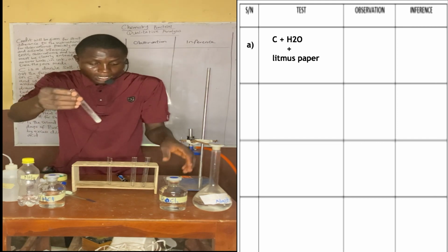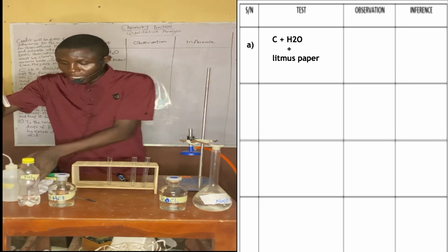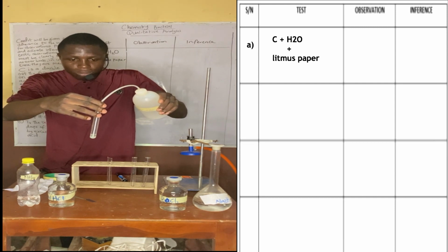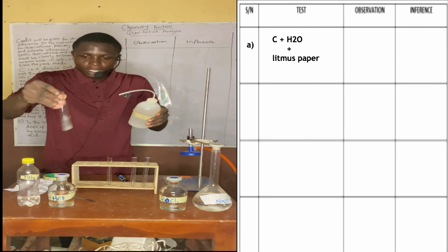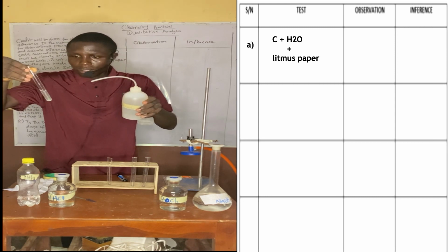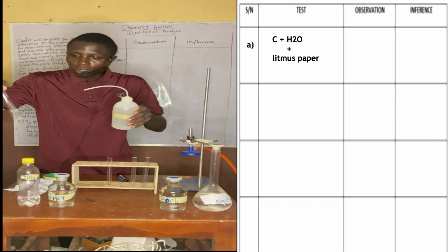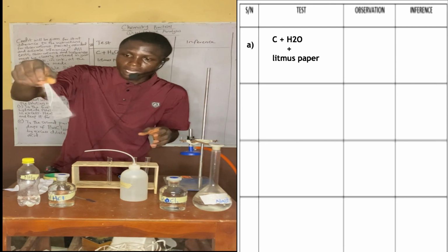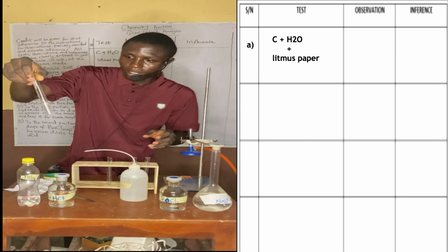You can see there's a light green crystalline salt. Now add about 5 centimeter cube of distilled water. You can use a measuring cylinder to measure your distilled water, but I'm just adding distilled water to it.